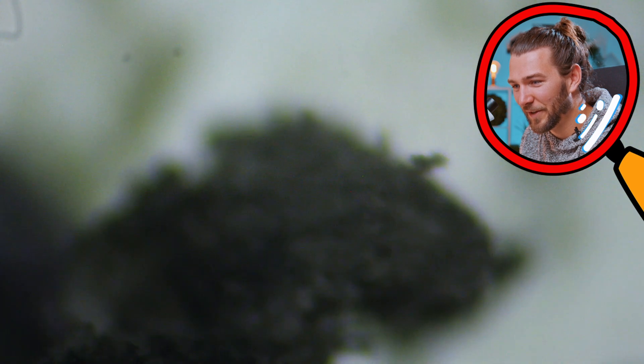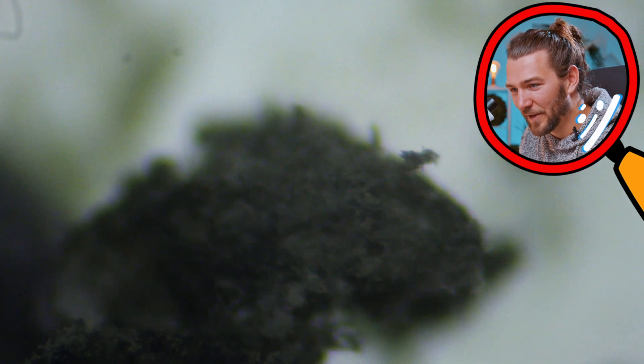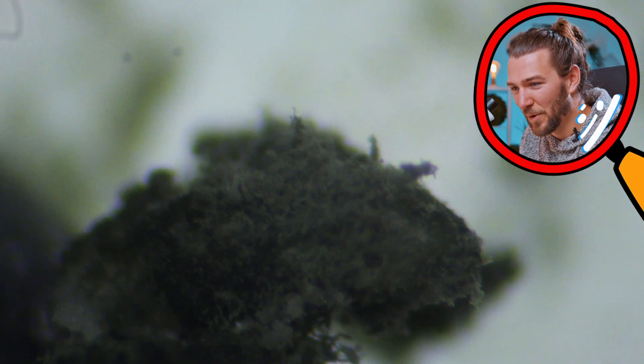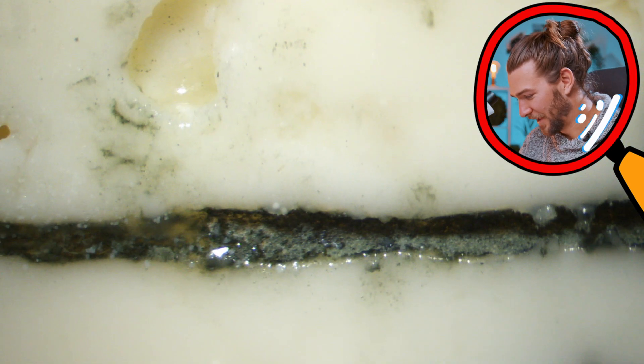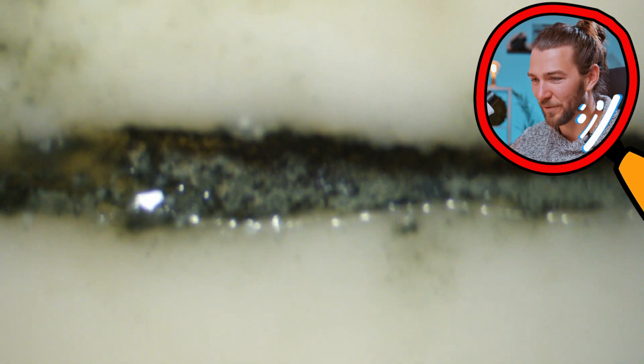You can now see also a bit more detailed. It's like one big patch of moss now on this magnification. Here we have also, instead of like a patch, we got here a line that goes across the whole cheese. It's quite cool.